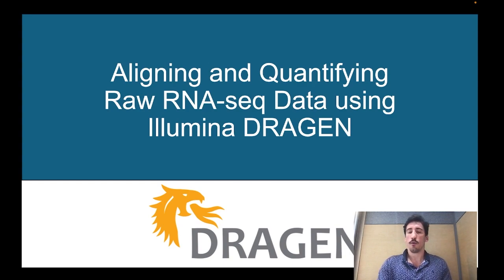So with that, today we'll be going through the steps of RNA-Seq sample preparation, raw data output, what it actually is, what it means, and how you will perform the quantification and what quantification actually is. So let's start with how RNA sequencing samples are prepared.